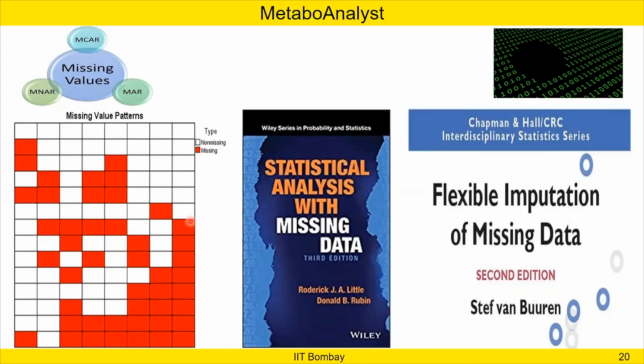And then what to do with these missing values, because it is very difficult to do any statistical analysis in the presence of these missing values, right? I will request that you go and read these two books that are available online, and they will give you much information regarding missing value imputation, types of missing value imputation, and what is the best way to estimate these missing values.